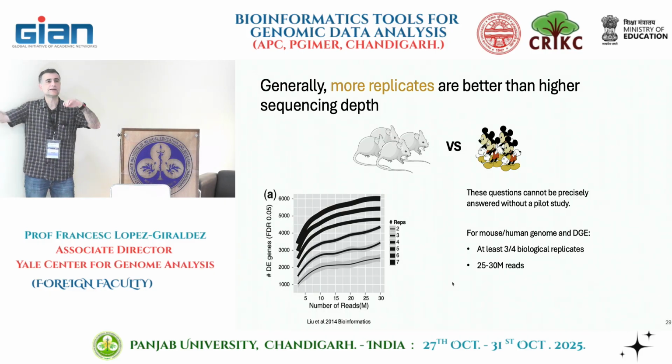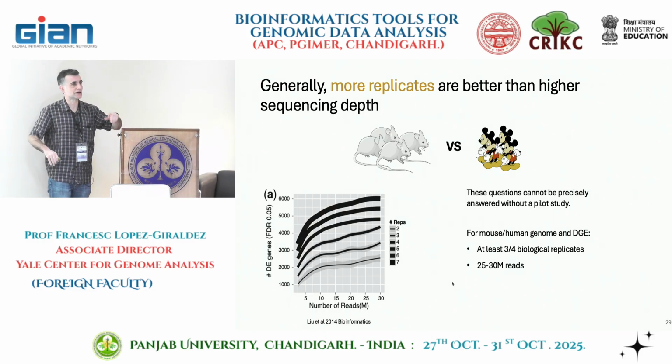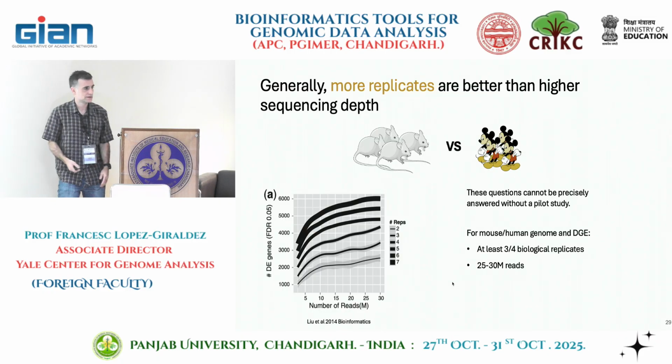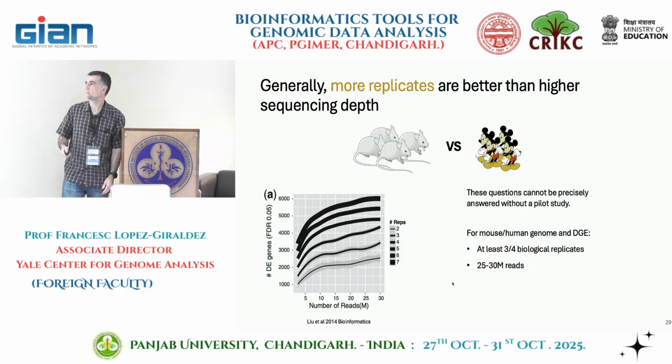In these cases I'm talking about replicates, I'm talking about quantification studies, right? If you are trying to do variant calling, replicates are not important in that case, because you only have the samples that you have. But anything that you are quantifying, peaks, ChIP-seq, all those type of things, you need to think about replication.